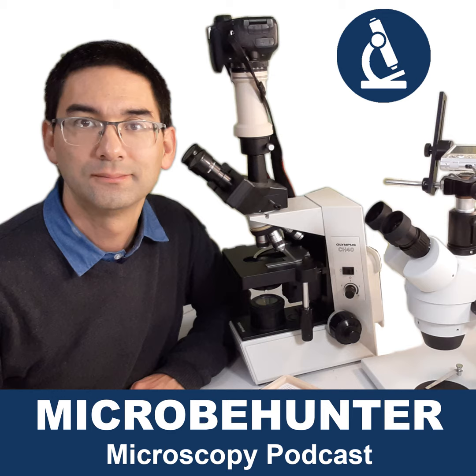And when you buy a compound microscope, so I'm not talking about stereo microscopes now, which are a different thing, but conventional compound microscopes, then most of the basic models come with 3 objectives, and they magnify 4 times, 10 times, and 40 times. That's kind of a standard. Some better or more expensive microscopes might add a 100 times oil immersion objective, so they have a total of 4, or a 60 times non-oil immersion objective.